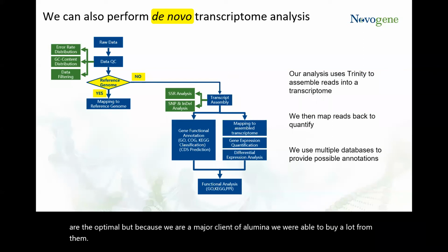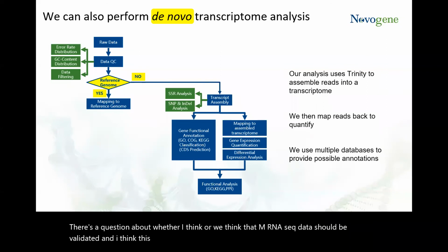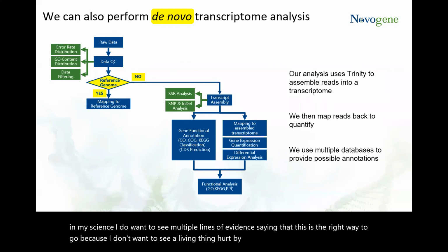There's a question about whether we think mRNA-Seq data should be validated. And I think this depends on the goal of your project. Certainly, if you're interested in drug discovery, if you're interested in setting up a clinical test, I'm a little bit more conservative in my science. I do want to see multiple lines of evidence saying that this is the right way to go because I don't want to see a living thing hurt by a wrong answer that we may have gotten accidentally.